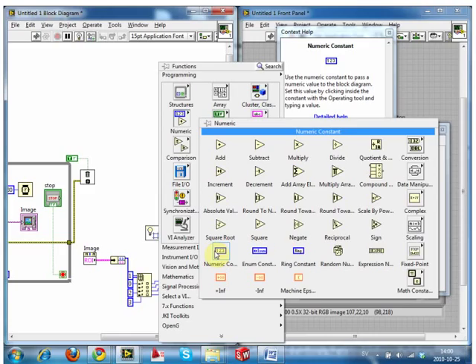Once you have these, this rectangle function essentially puts them in a 1D array. So essentially treat it as a number with commas between. Let's say x1, y1 is 1, 1, and x2, y2 is 3, 3. Then in the array, it has 1, 1, 3, 3. That's a string of numbers.